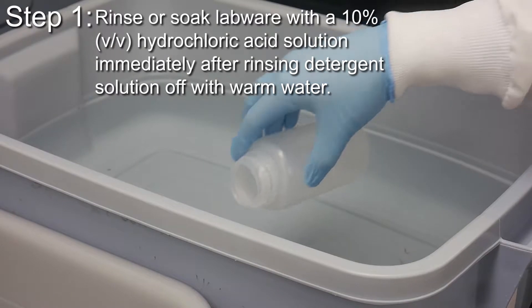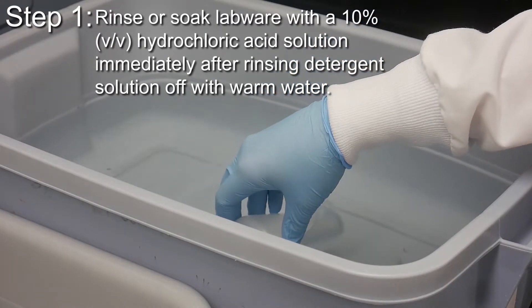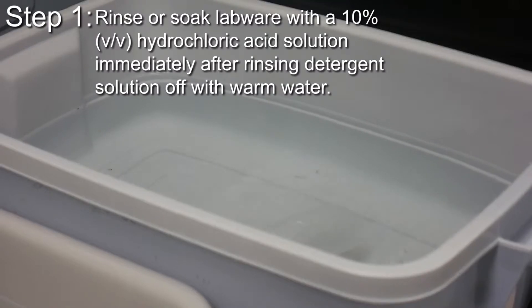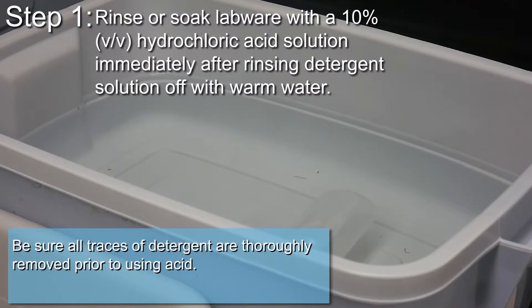Rinse or soak labware with a 10% hydrochloric acid solution immediately after rinsing the detergent solution off with warm water. Be sure all traces of detergent are thoroughly removed prior to using acid.